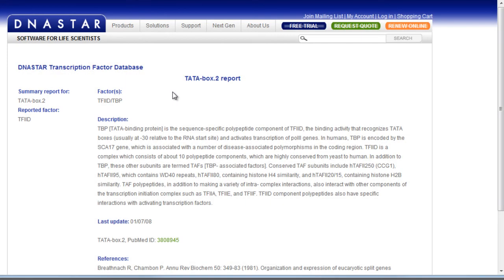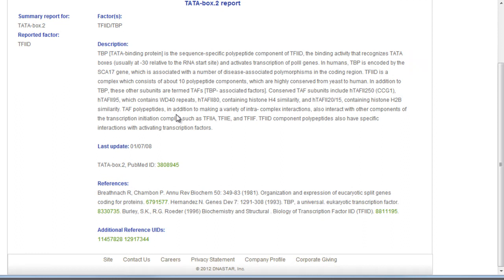You can also see detailed information about a transcription factor by selecting a pattern, then going to Sites and Features, Lookup Site, Description. This will open the DNA Star transcription factor database in your web browser, where you can read about the transcription factor description and PubMed references.